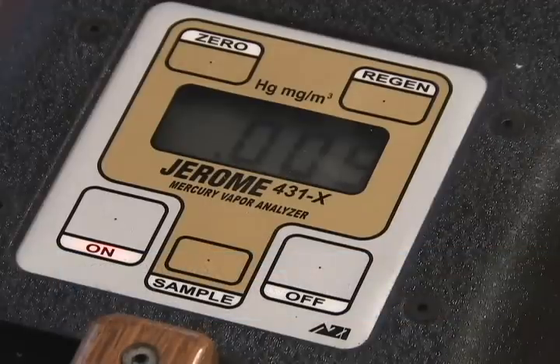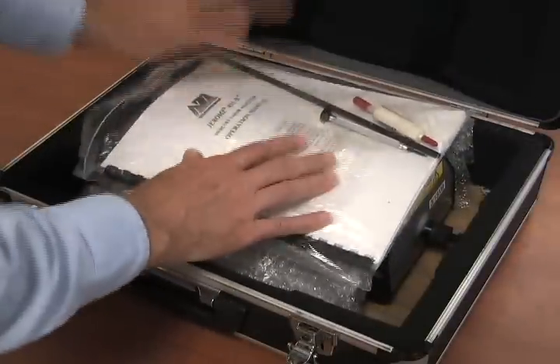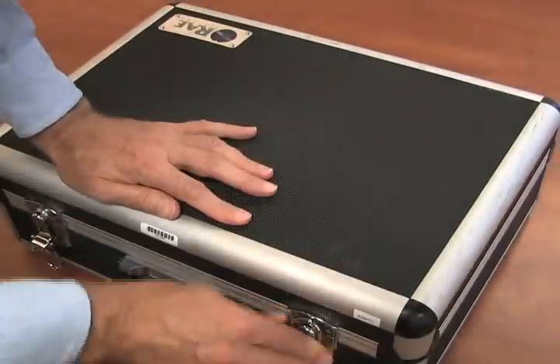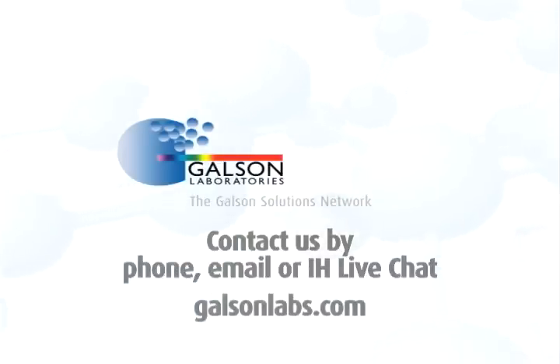When the survey is over, turn the unit off by pushing the on-off button. Remove the probe and repack for shipment back to Galson Laboratories. Questions? Contact Galson Laboratories by phone, email, or IH Live Chat. And access our extensive library of helpful videos at galsonlabs.com. Thank you.